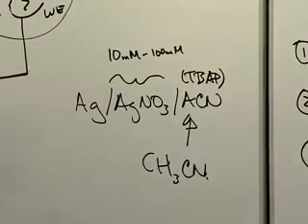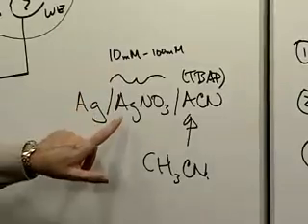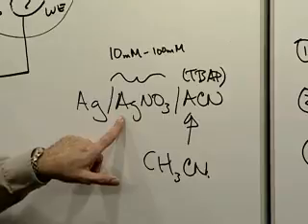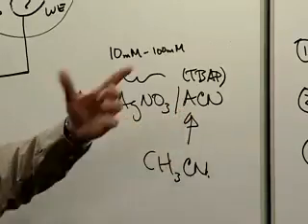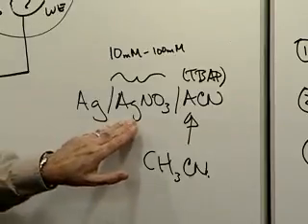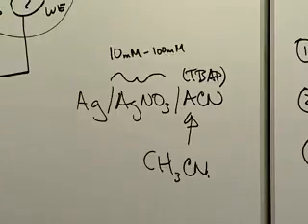Well, at least you're not bubbling a gas through this, so you're not rapidly evaporating your solvent, so this concentration shouldn't change too much. But this is not a sparingly soluble salt, remember. So if there's any way the acetonitrile can evaporate, you will change your concentration here. That's number 1. Number 2 is it is a light-sensitive electrode, quite a light-sensitive electrode, and you will change your concentration again by converting silver ions into silver metal over here.